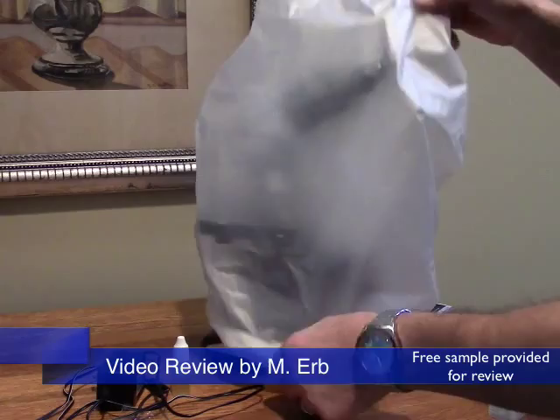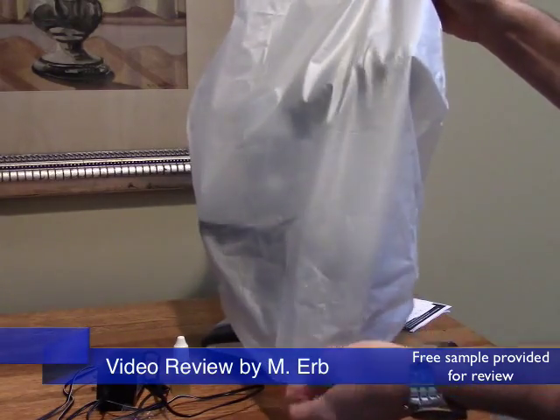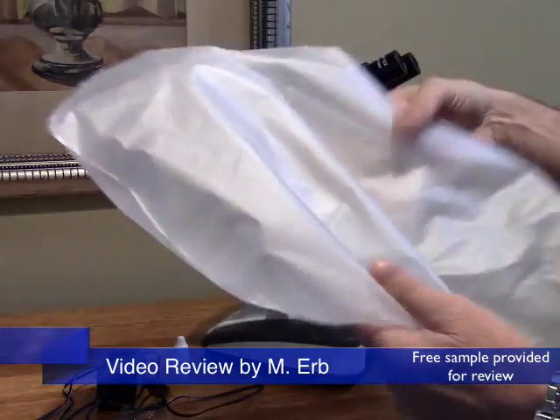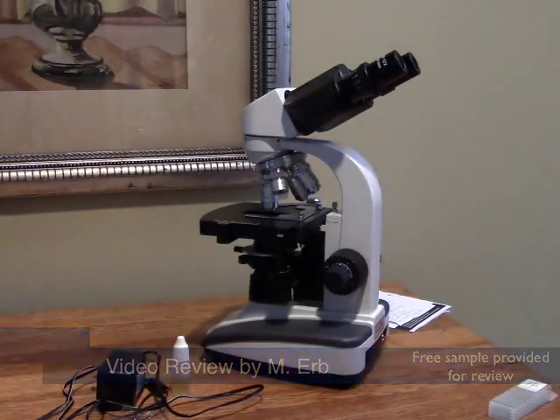It's covered right now and you always want to keep your microscope covered when you're not using it to keep dust off the lenses. This is one of the accessories that is provided — the nice little plastic cover.